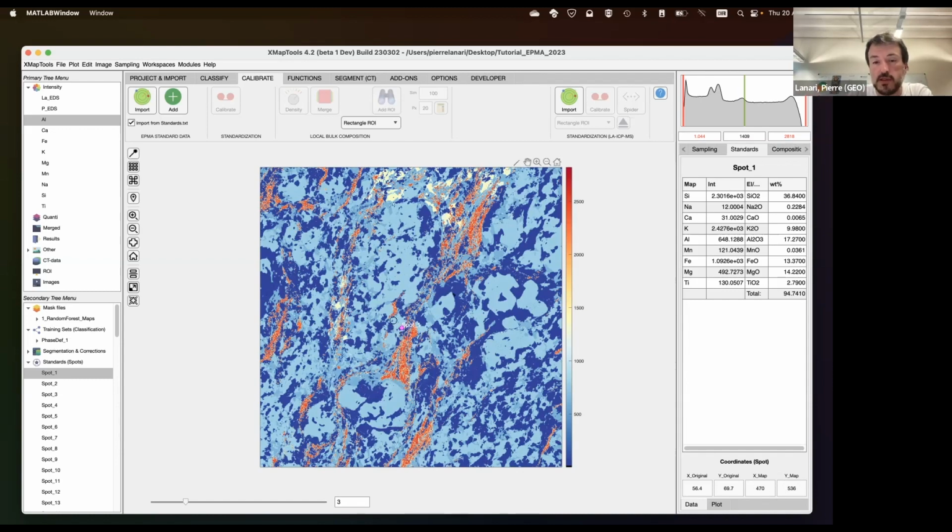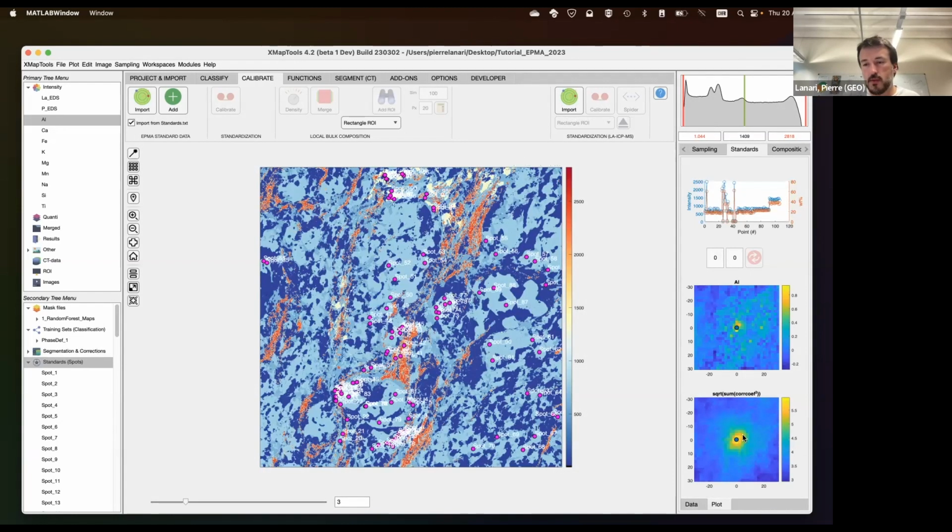And you can, if you want, decide to move the spot. So if you have a spot that was slightly different, or because the sample slightly moved during the spot analysis measurement and mapping, this could happen. You can simply correct here the position by moving the spot. And you can go through the spots and you see now where they are. You see the composition, and if one is bad, you can simply right-click on it and delete, and that will eliminate that specific spot.